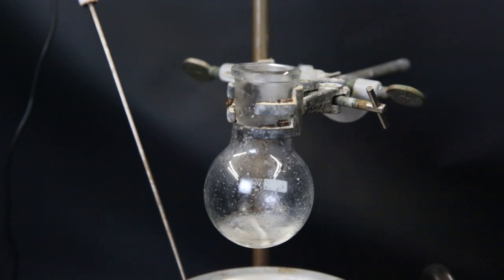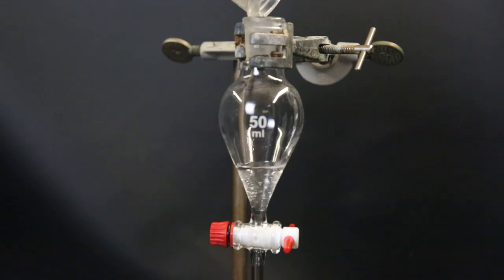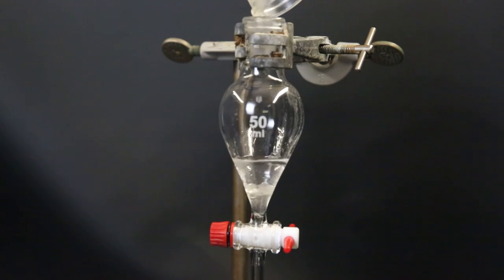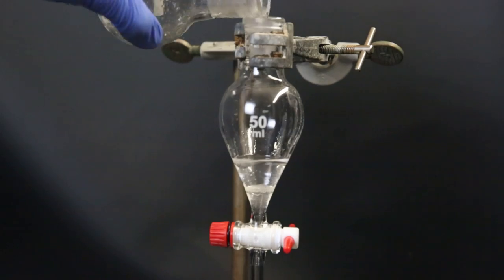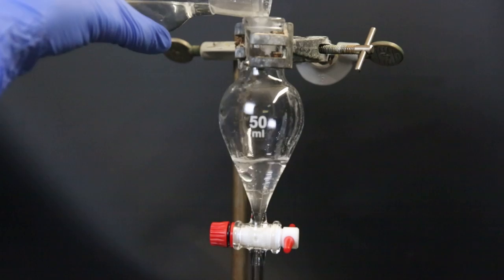Now the mixture has separated into two layers. I move it all to a separatory funnel and we can see the product sitting on the bottom. It still needs to be washed, so it can't simply be drained off. First, I add about 30ml of diethyl ether to take up the product.